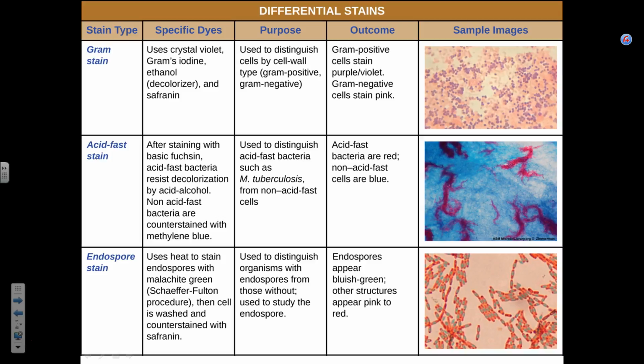For instance, gram stain allows you to tell apart cells that are gram positive and gram negative. I do not know if Hans Christian Gram, the guy who developed this stain, actually knew about those fine differences between different bacterial classes. It turns out this stain reflects the fundamental properties of the bacterial cell.